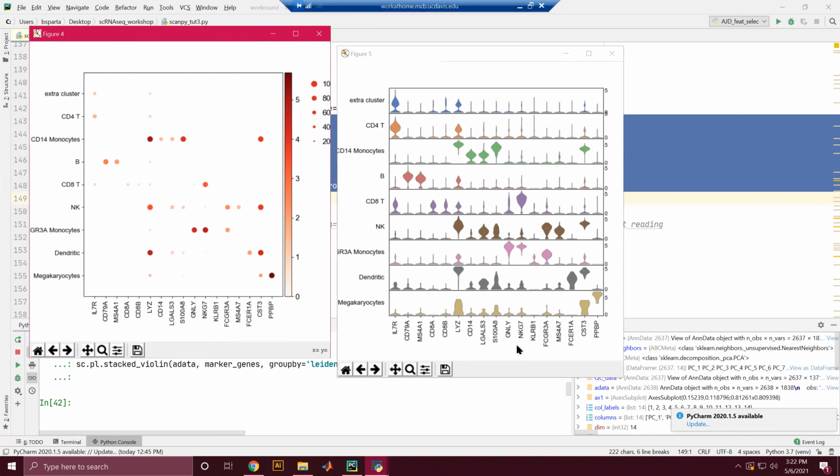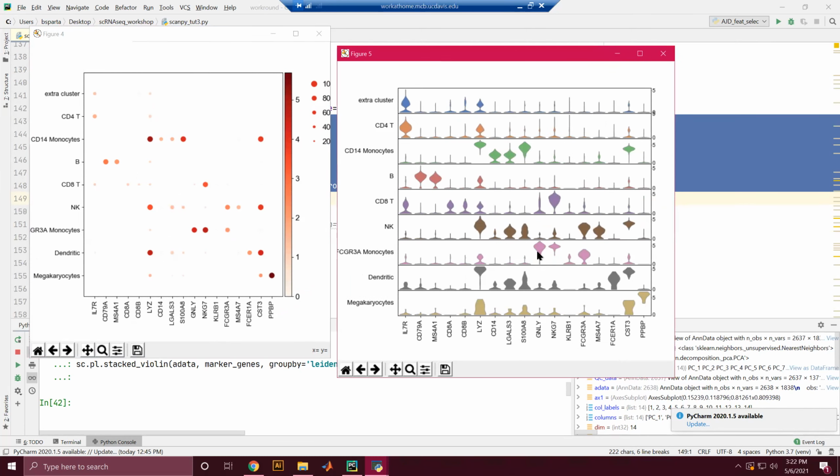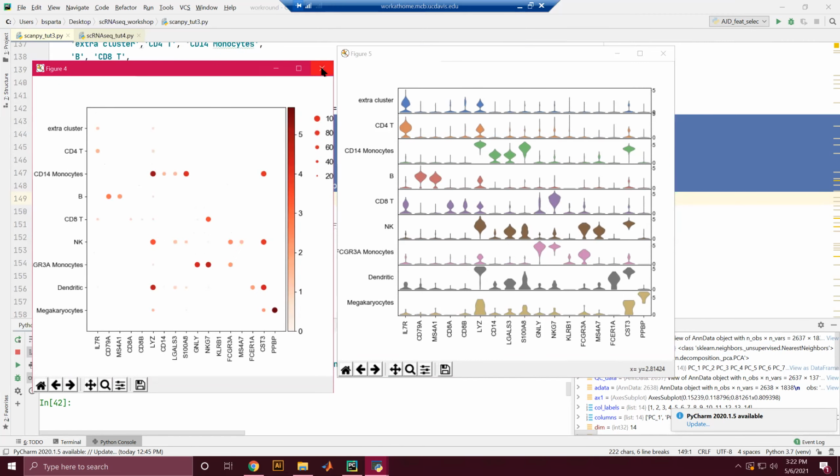So here's this one gene that I know what it is. GNLY is a protease that helps break down bacterial cell membranes. So as you can see, we find this in... I would expect to see it in natural killer cells, but we don't actually, and that's kind of strange. So maybe our clustering is a little bit weird. Interesting.